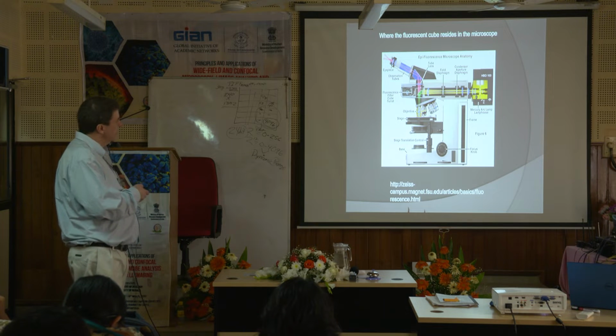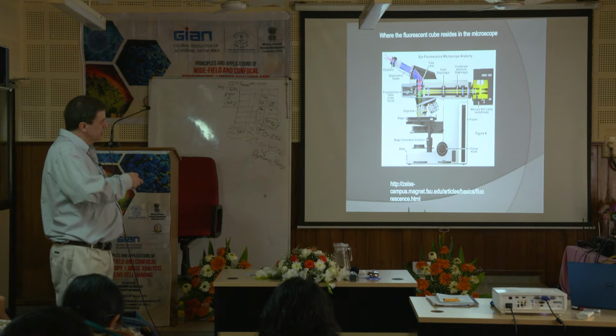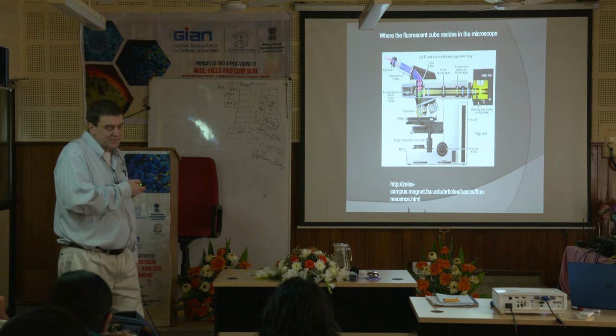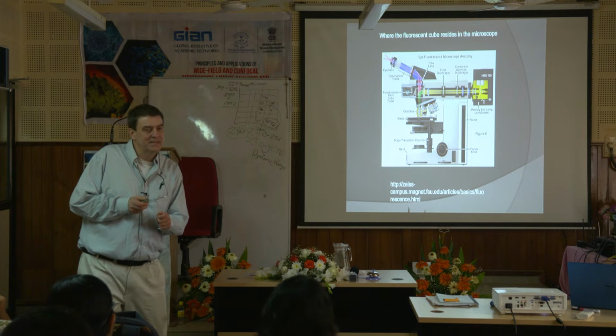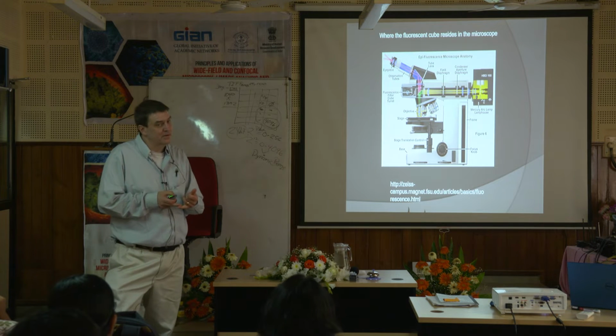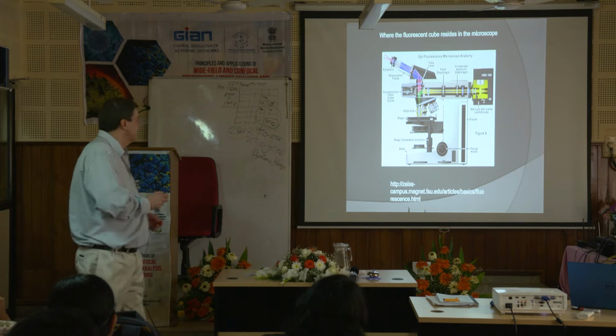And I have one like this in my lab. What kind of microscope is this, with the objectives on the top? Remember, we talked about this the other day. This would be a what type of microscope? Would it be an inverted microscope? Would it be an upright microscope? Okay, it's an upright microscope, right.